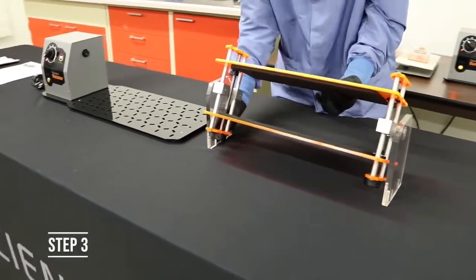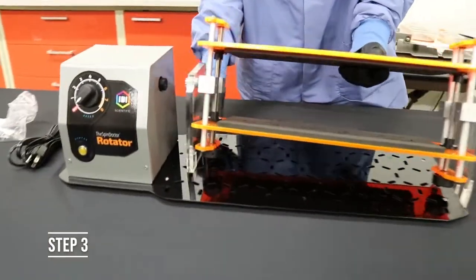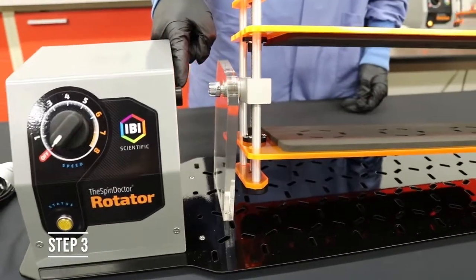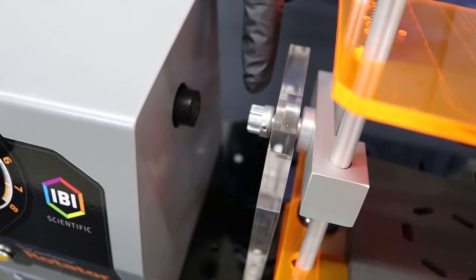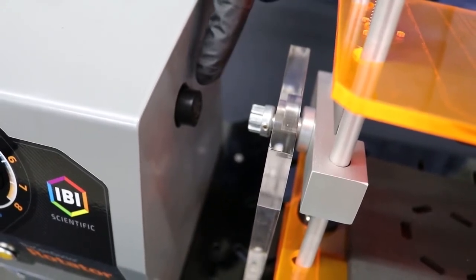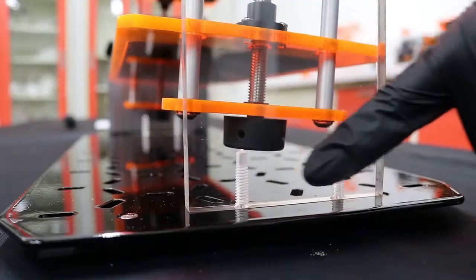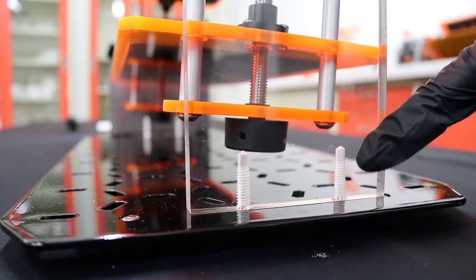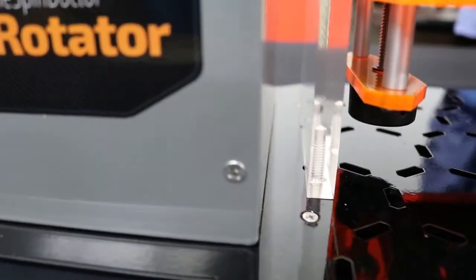Step 3. Now place the platform assembly onto the open part of the base next to the control module. Make sure the platform assembly is oriented properly with the mating part to the motor coupler towards the control module. Next, orient the legs downward so the threaded holes are pointed down towards the base.